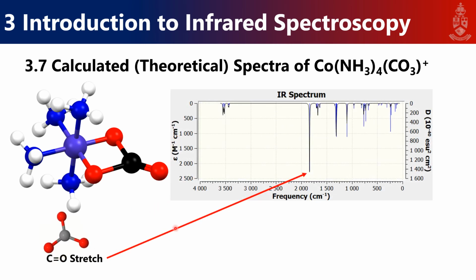So focusing on the CO stretch, you can see there is now a peak here next to our NH bend. There is a very strong peak, actually a fundamental stretch. A fundamental stretch is just the one that's the strongest in the spectrum, the tallest one, the one growing from the top. That's called the fundamental stretch, and that corresponds to this CO stretch that you see, right?